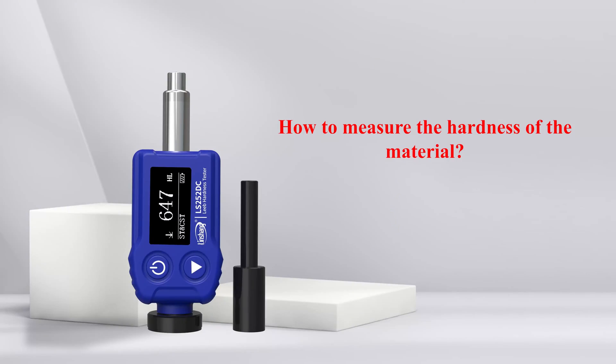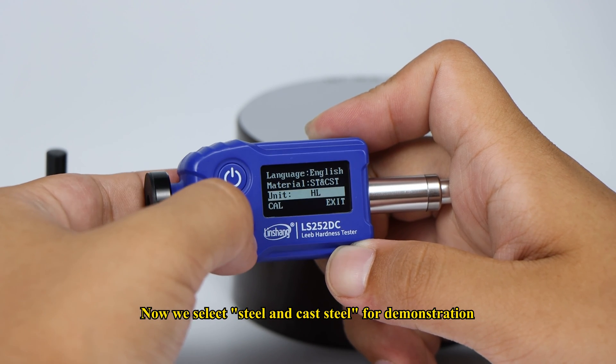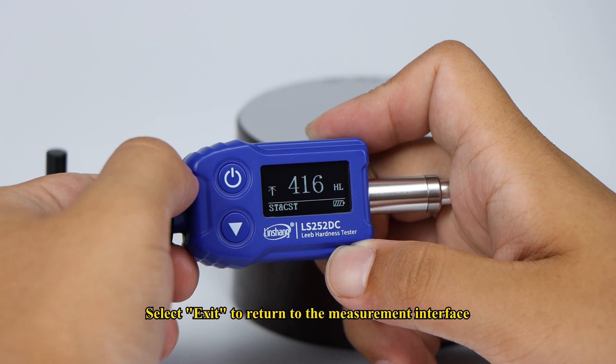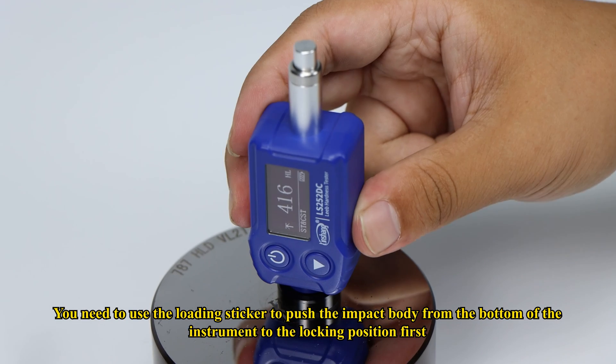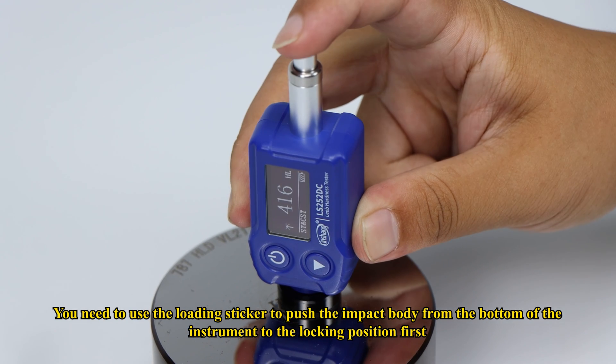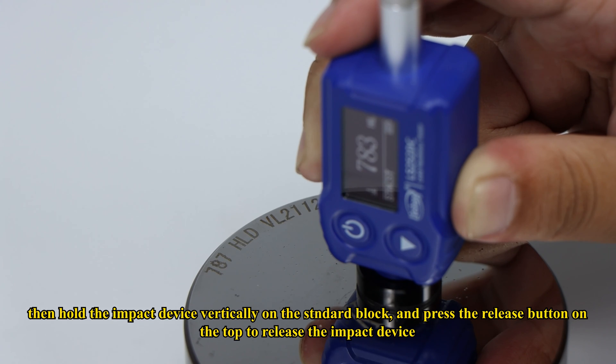How to measure the hardness of the material: Select the material you want to test before testing. Now we select steel and cast steel for demonstration. Select exit to return to the measurement interface. Use the loading sticker to push the impact body from the bottom of the instrument to the locking position first. Then hold the impact device vertically on the standard block and press the release button on the top to release the impact device.